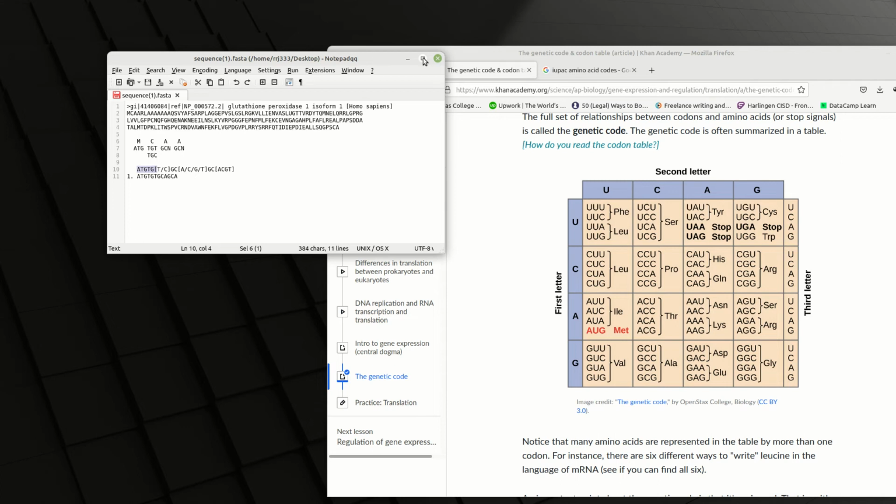So a little bit further down, we have the gap between it when it starts copying. Then we'll have a UTR, and then you'd have a start codon. So anywhere 0, maybe 100 base pairs at the most, and then we should see something like this. So let's go see what we can find in our sequence.